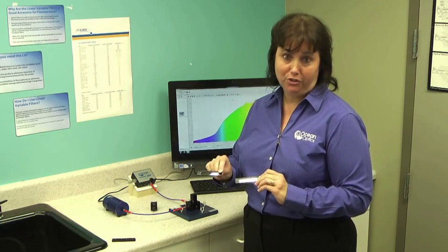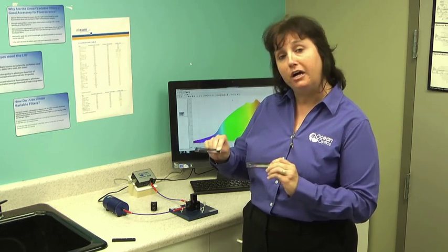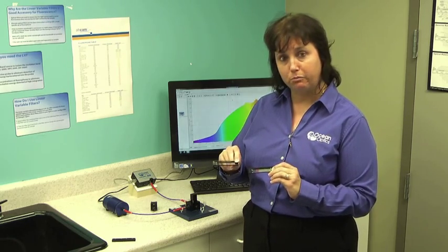So these can also be used anytime you want to pass either all the wavelengths above or below a specific wavelength for your fluorescence measurements.